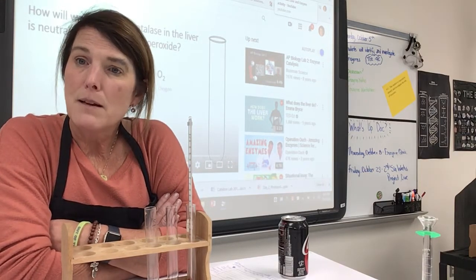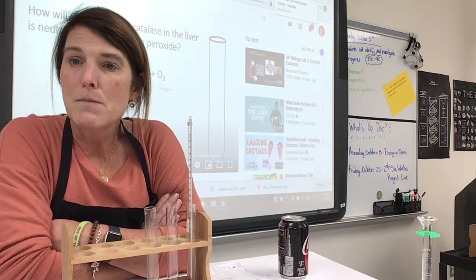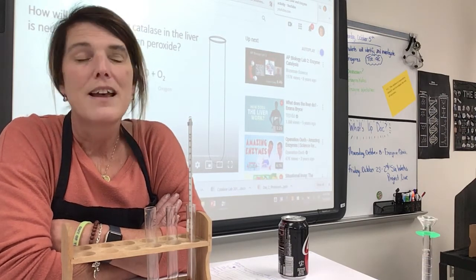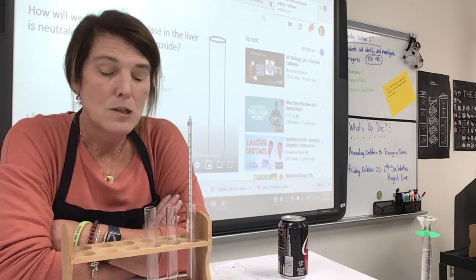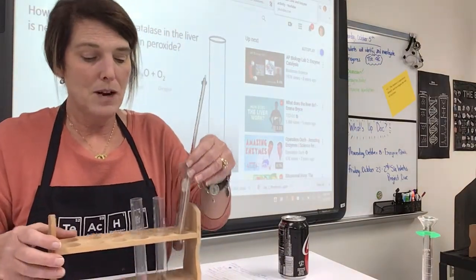G, a gas like bubbles. L, a light might be emitted. T, a temperature change. S, a smell. Or precipitate forms. In this case, definitely a chemical reaction will occur.